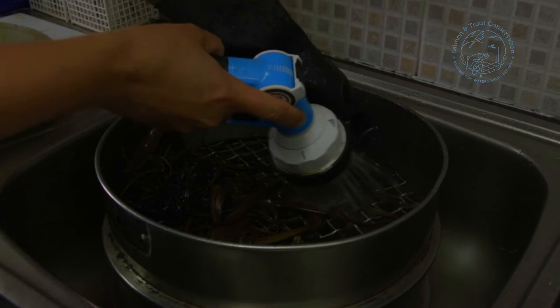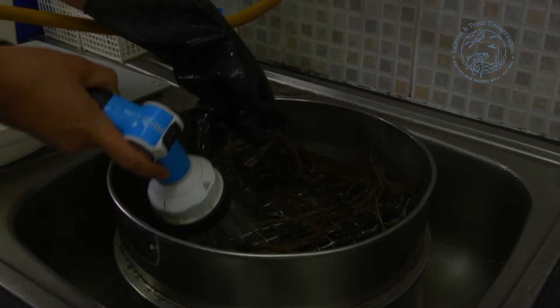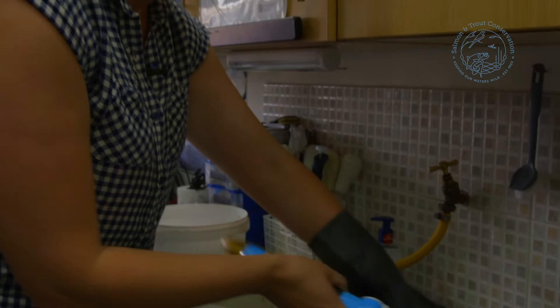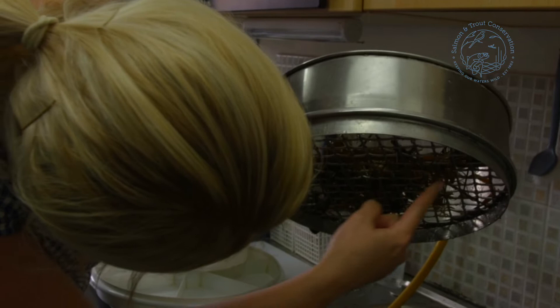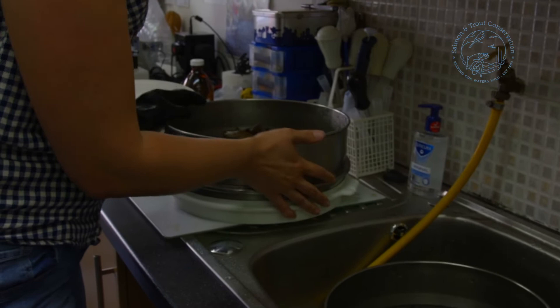I've rinsed through the sample and I'm just going to do a hand search to make sure I haven't lost anything hidden within the weed or debris or attached to anything. You quite often find that gammarus and caddis will get themselves a little bit stuck. Once we've washed through that, just do a little check underneath to make sure no animals have attached themselves to the sieve.